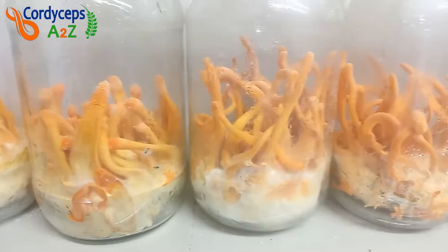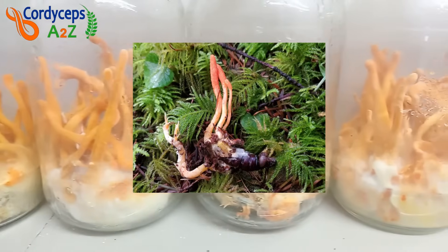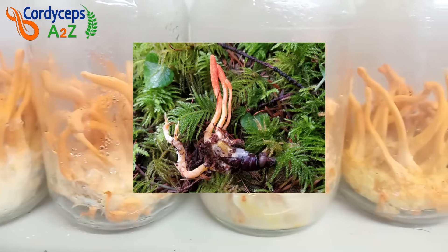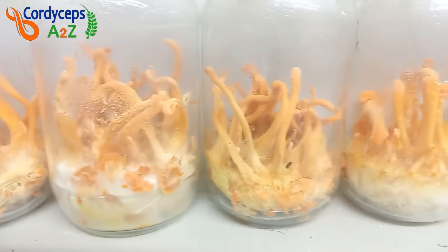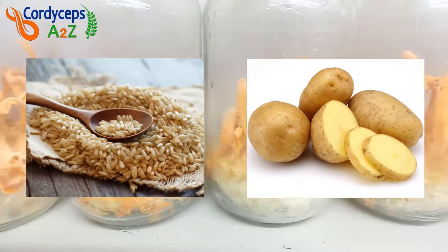Cordyceps militaris mushroom is a fungus that lives on certain larvae of insects in high mountain areas and grows there naturally. But we can also grow Cordyceps militaris mushroom in a controlled environment lab with 100% vegetarian ingredients.